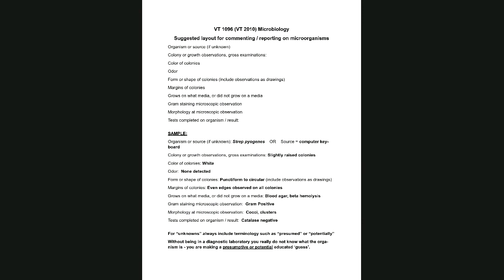But if it's an unknown, okay, it is a mixed colony, or it came from a swab of the mouth, came from a wound, where is that source? Is it a known organism? Is there a source? And the species should be included. Did it come from a canine, a porcine, an equine, oral cavity, wound, where?